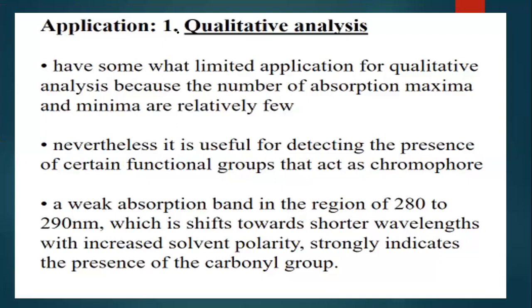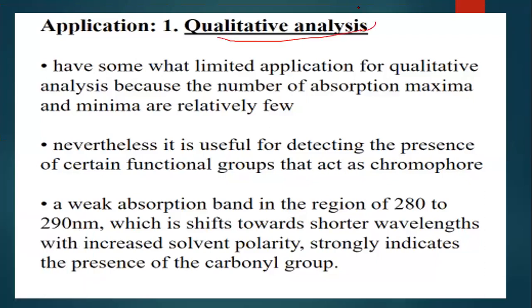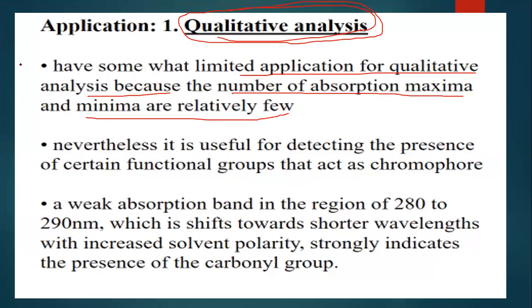Now see, qualitative analysis. What things can you find out? It has some limited application for qualitative analysis. The number of absorption maxima and minima are relatively few in this technique. Hence it can still be useful for detecting the presence of certain functional groups that act as a chromophore.